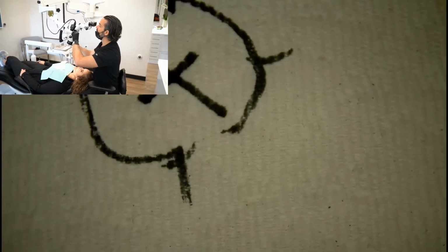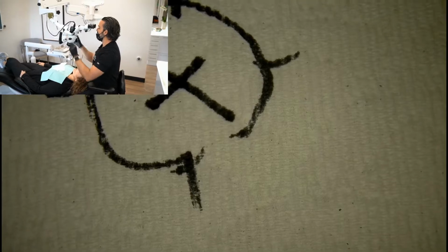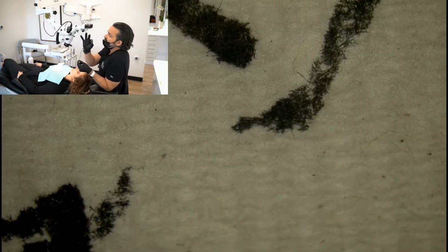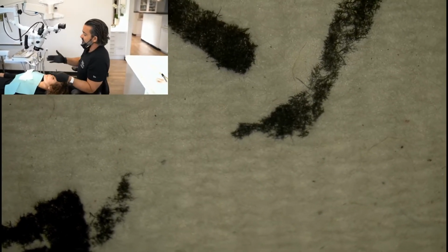All right. So I'm at my lowest magnification, and I'm in focus. Now, if I go up to my highest magnification and tweak this in a bit, then I can remain in focus. So part of it is you dial it in at the shallowest depth of field, and then that'll let you proceed. Now, like I was saying earlier, that's fine, and it's true when everything is static.